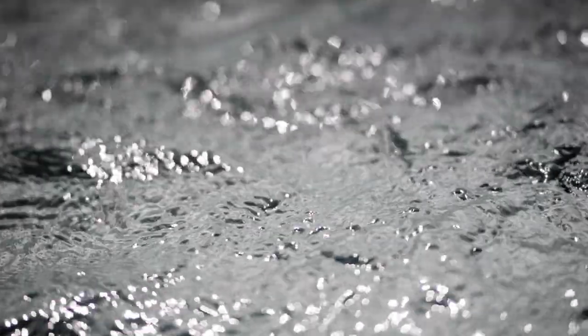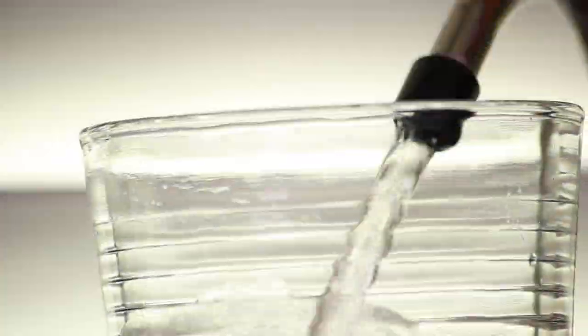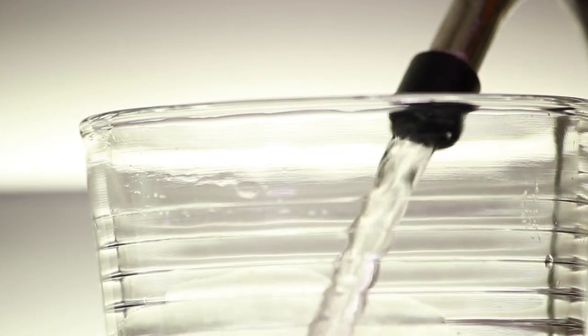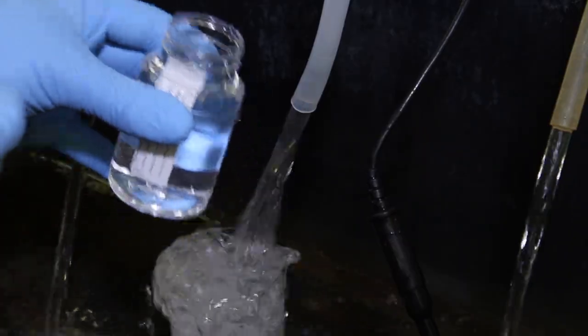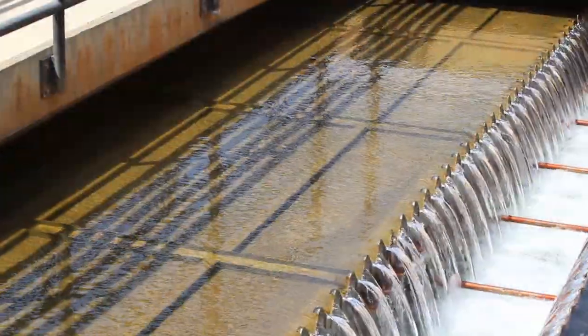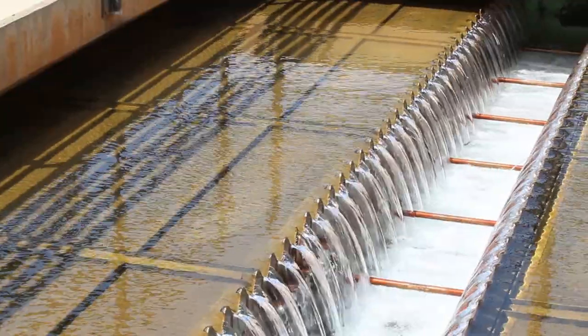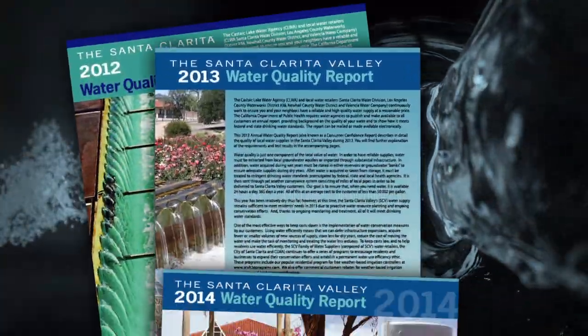The primary focus of water utilities is to provide safe and reliable drinking water to its customers. To achieve this, drinking water is subjected to thousands of tests and a variety of treatment processes. Quality reports are provided to customers annually.